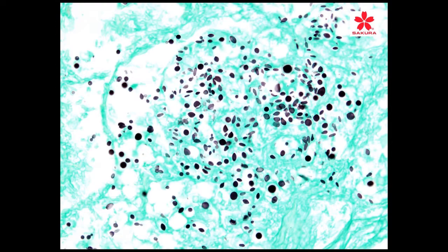So moving on to these silver stains that I mentioned before, I go back to the class and I ask them to grade this stain. And so I'll ask you all that too. If you can note how you would grade this stain, and if there were any issues with it, what would you say are the issues with this stain? Some people have said this is an optimal stain because you can see all the organisms staining, which is a valid point.